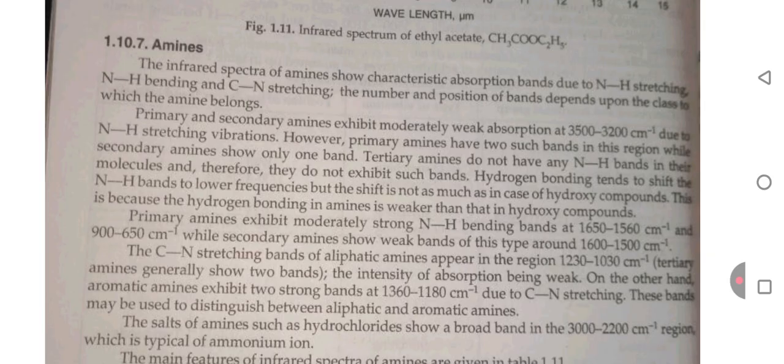Hydrogen bonding tends to shift the NH band to lower frequency, but the shift is not as much as in the case of hydroxyl compounds. This is because the hydrogen bonding in amines is weaker than that in hydroxyl compounds.